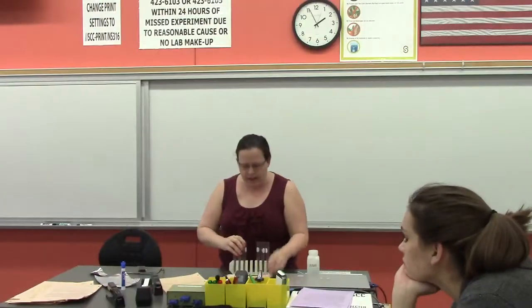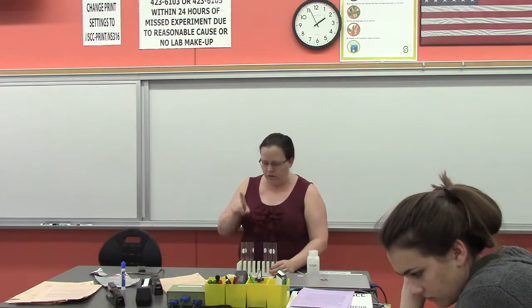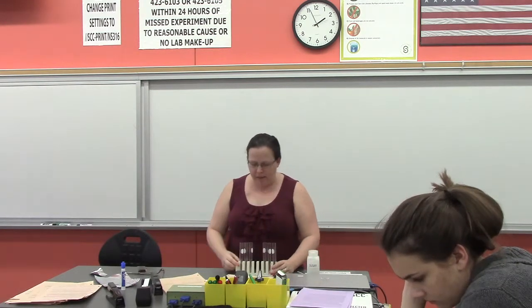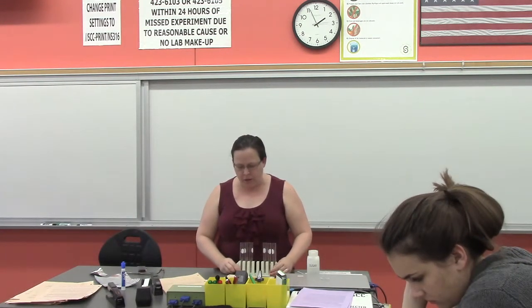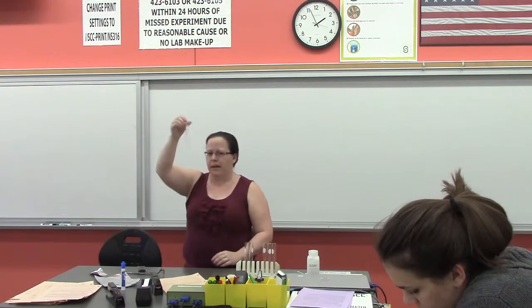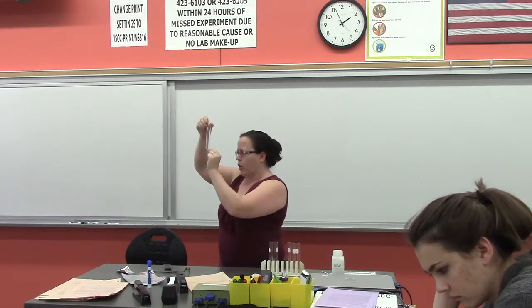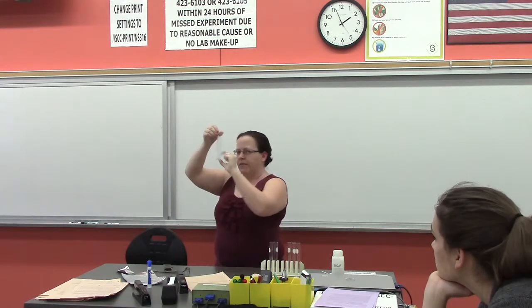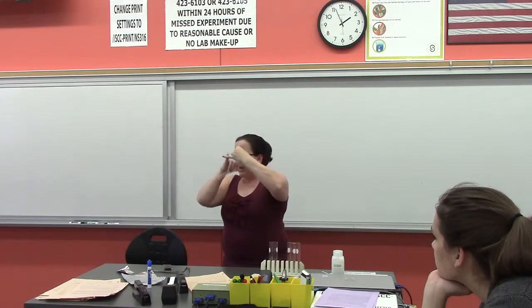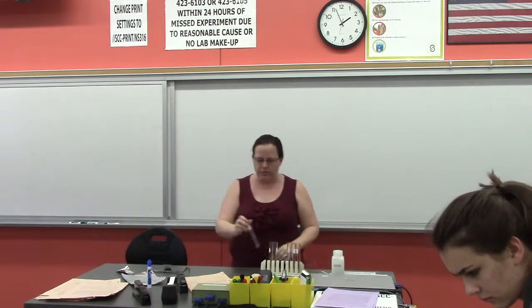And that says, in 3 separate test tubes, make mixtures that are water and ethanol, water and mineral oil, ethanol and mineral oil. Add about 1 to 2 milliliters of each liquid. Note that about 20 drops is a milliliter. In these big fat test tubes, a milliliter is barely past the curve on the test tube. If you have a skinnier test tube, a milliliter is the same as about your pinky height on your test tube.